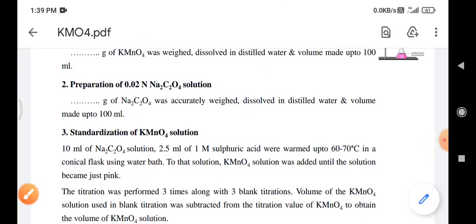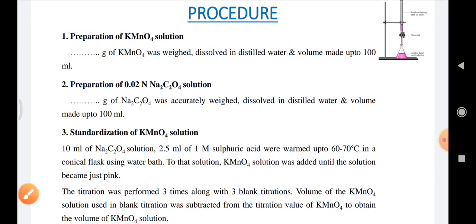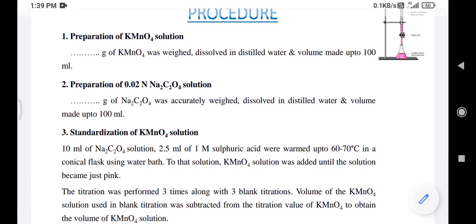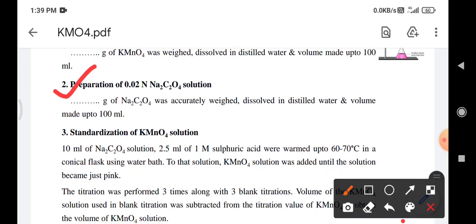In the first step, we prepare the KMnO4 solution by weighing the required amount of KMnO4 (as calculated in the calculation section), dissolving it in distilled water, and making up the volume to 100 ml. In the second step, we prepare 0.02 normal sodium oxalate solution by accurately weighing the required amount of sodium oxalate, dissolving it in distilled water, and making up the volume to 100 ml.